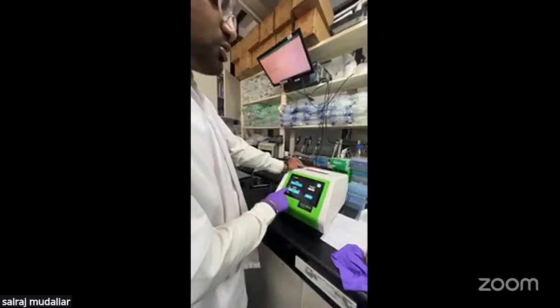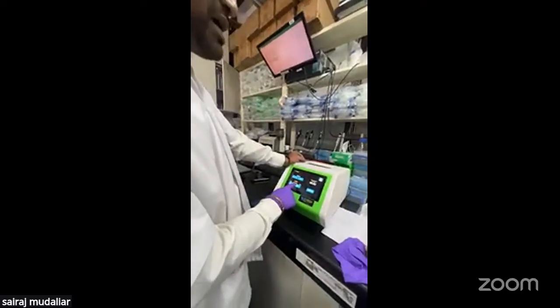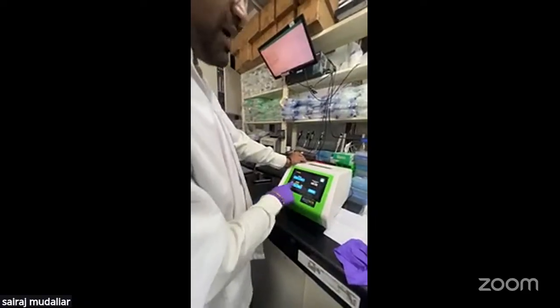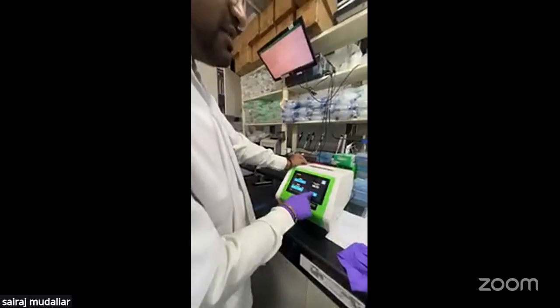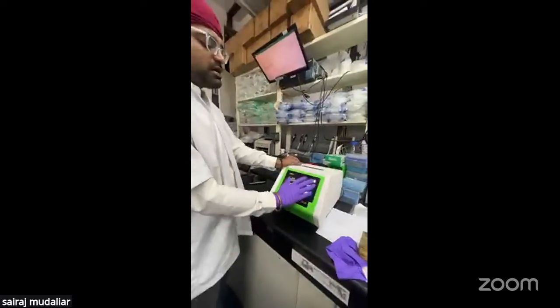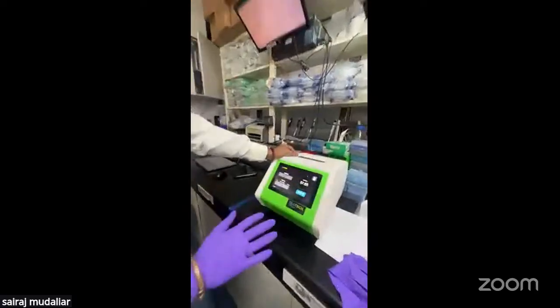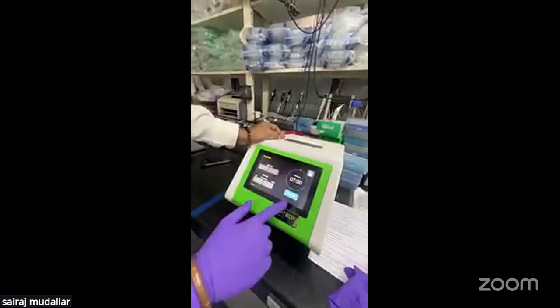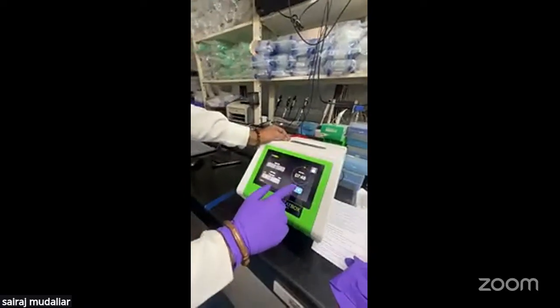You can set the standard as low or high based on what kind of magnetic shearing pattern you want. So I can set it for low and then just start the samples. So you can see the time has initiated, and within 8 minutes you can be done. So I will just stop this reaction for now.